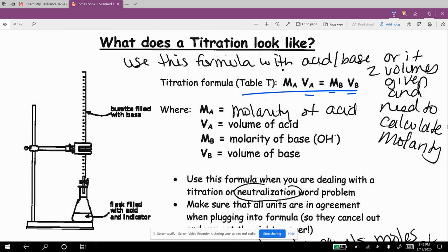All right, so this is what this situation is going to look like. This is a skinny tube called a burette, which is like a graduated cylinder, except it kind of reads backwards. Instead of having the higher number at the top, this goes from 0 at the top, and let's say this is a 50 milliliters to 50 milliliters at the bottom. And this is right down here. This is a little valve, like a little faucet, and you can open and close it. And when you open it, the liquid will drop out.